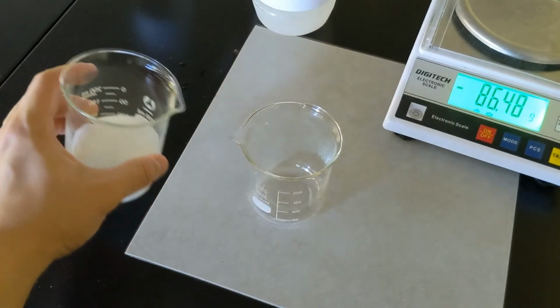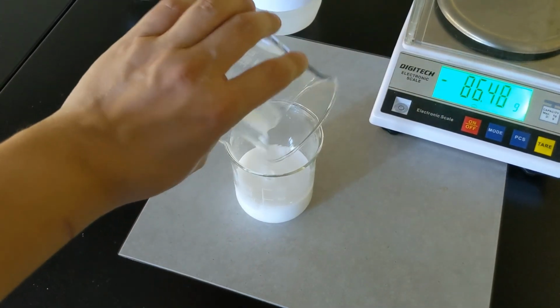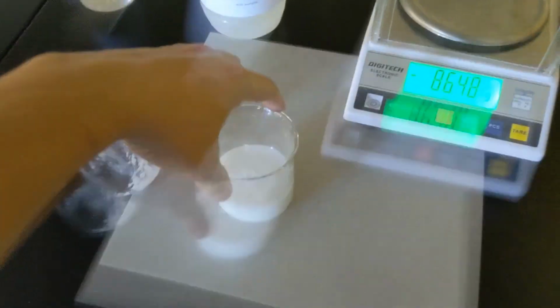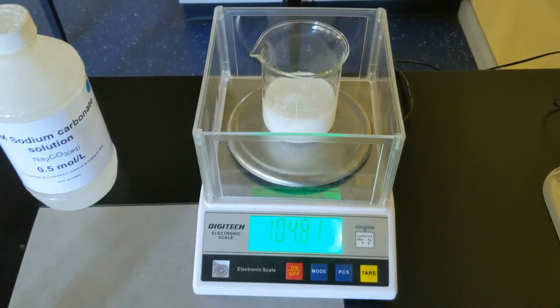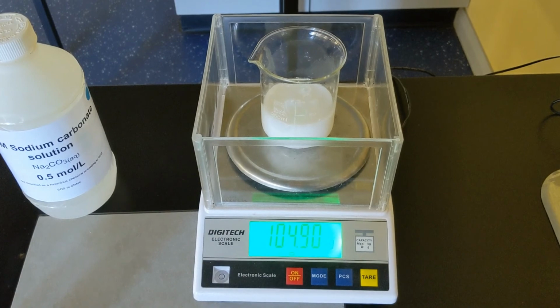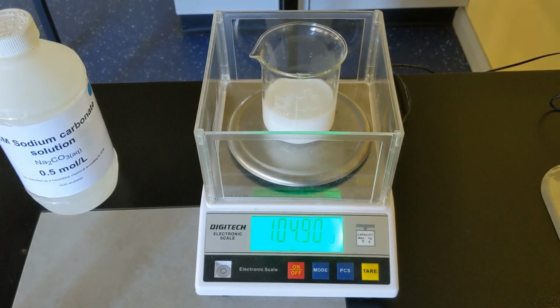I've transferred a mass over and we can figure out how much mass this has now. Putting it back on, it's already taken the mass of the beaker into account, and what we should get is a reading at the end that just shows the mass of the liquid. There it says 104.90 grams. This is less than the original mass that we got before. Some of that was left over, as we saw, as residue in the beaker.